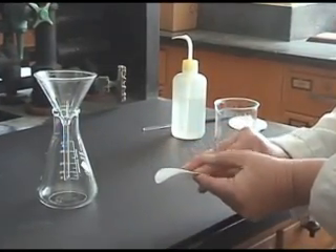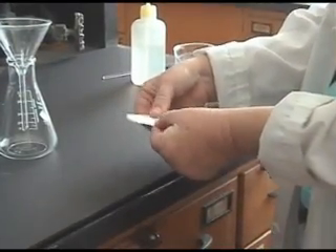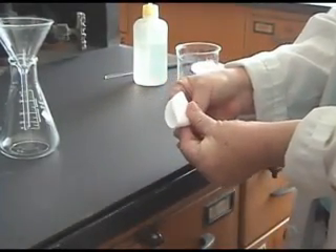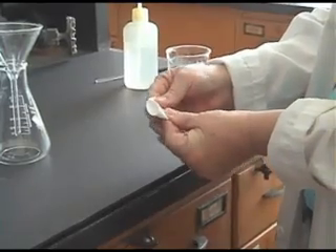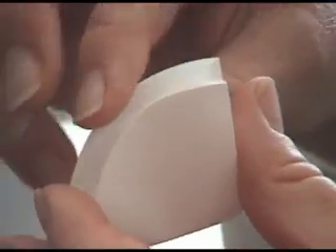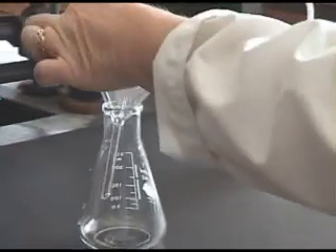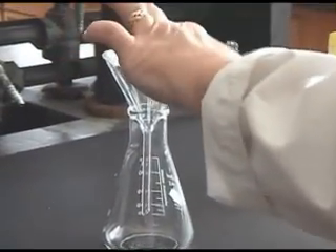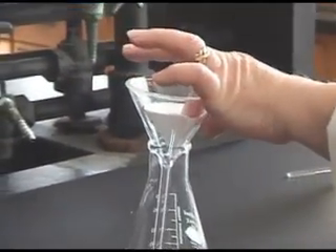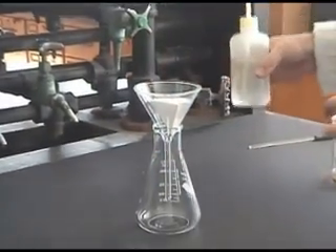You begin by folding the filter paper in half, and then folding it in half again. The filter paper is placed in the glass funnel so that the filter paper is just short of the rim of your funnel. Open your filter paper to form a cone, and wet it with a few milliliters of solvent.